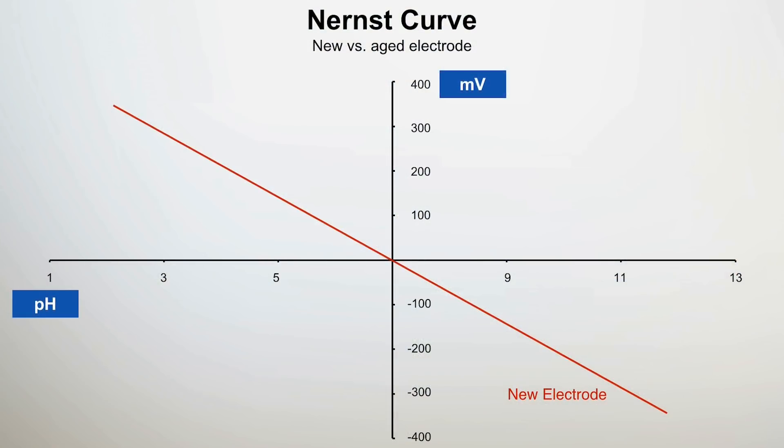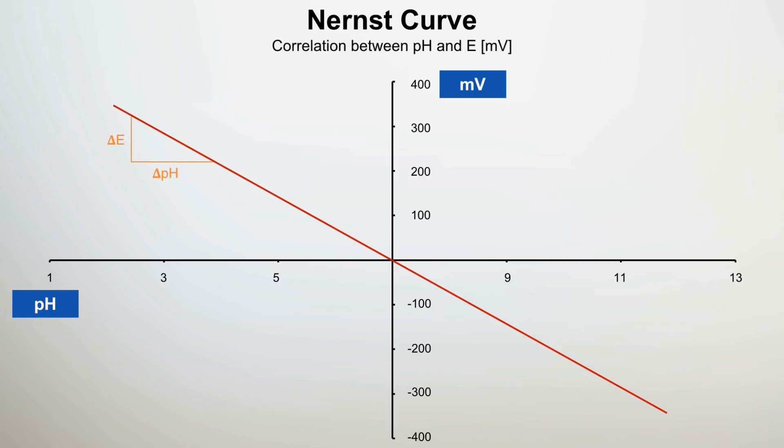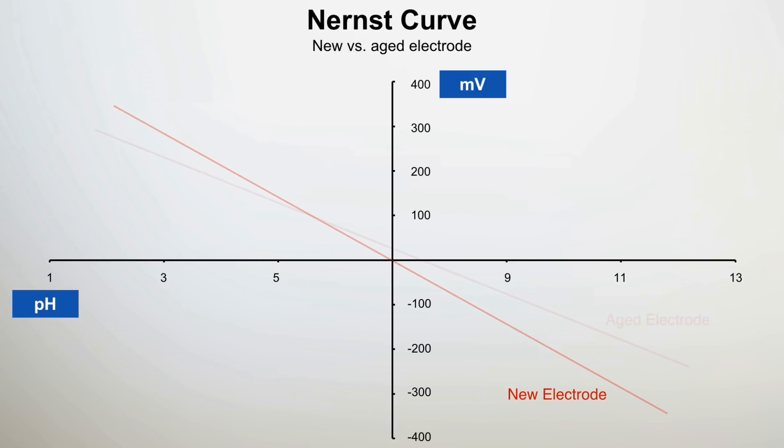Over time, every glass pH electrode undergoes an aging process where the sensor slowly loses its ability to respond to changing pH. The theoretical response of a pH glass electrode is described by the Nernst equation, which represents the response of the sensor as the change of voltage potential per pH unit. For example, at 25 degrees Celsius, the slope is approximately minus 59 millivolts per pH. The potential measured at pH 7 should be zero millivolts — the so-called zero point. As the sensor ages, the slope decreases and the zero point changes, causing measurement error.